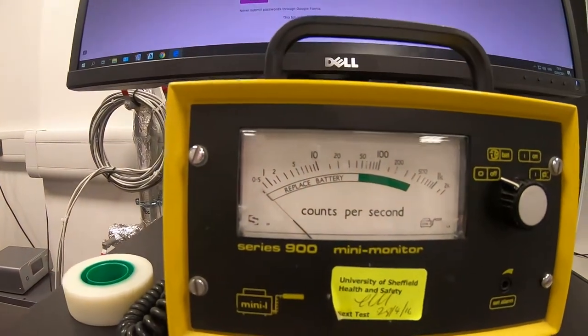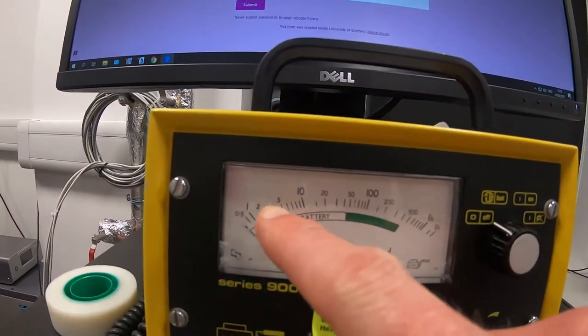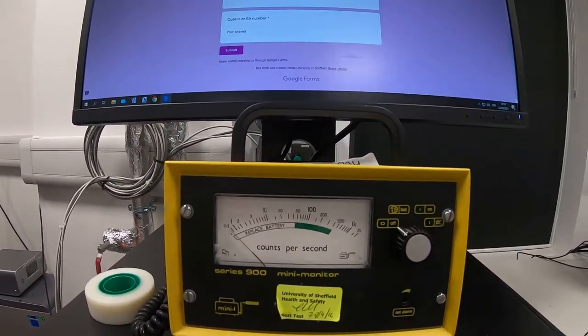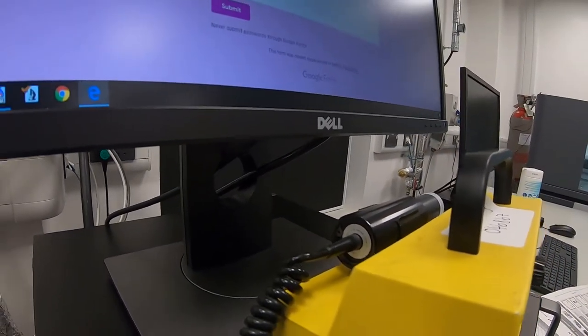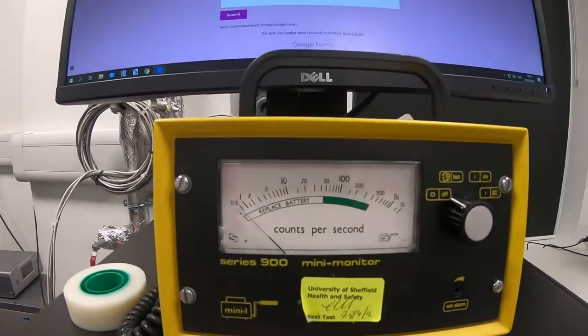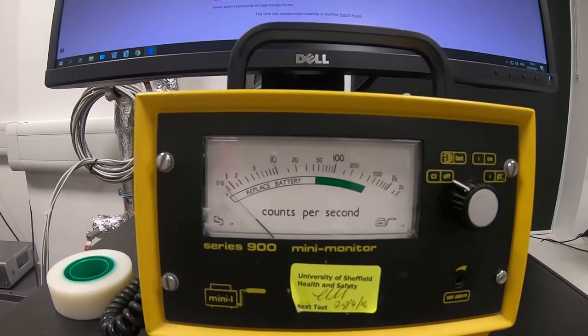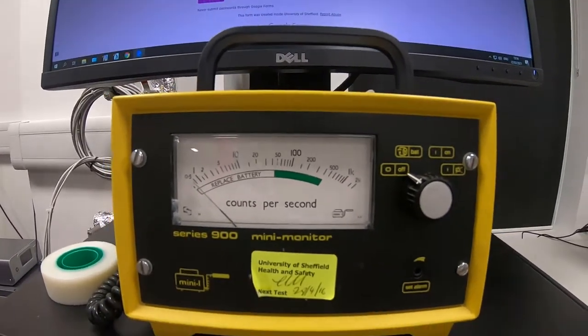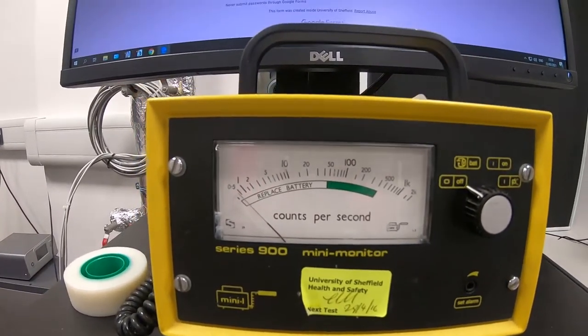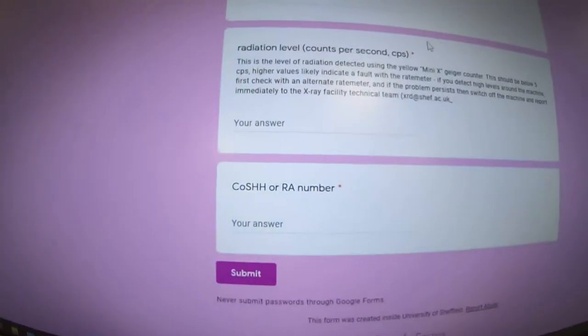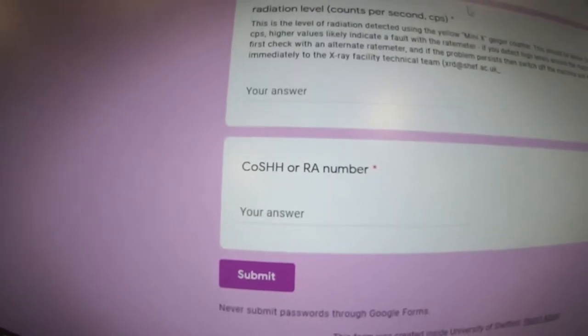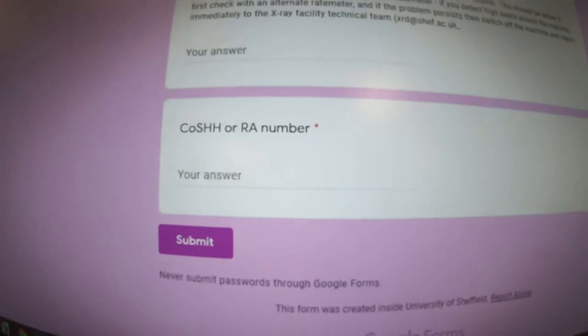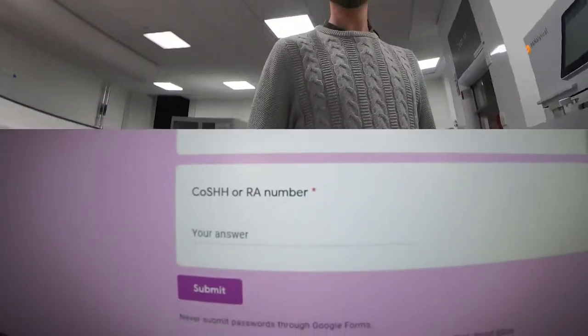This comes directly off the rate meter, so you'll notice that it'll hardly click at all generally, so you should be down at this end where it's between one and five counts per second. If it's much higher than that, it's probably because the instrument's a bit broken. Usually these cables get a bit damaged at the ends here, and that can cause it to count more often. The best thing to do is go and find another monitor and try that one. If you experience the same with high count per second, above 10, what you need to do is turn off the instrument with the big red buttons and come and get us straight away. The last thing to fill in on the form is your COSH number, or your risk assessment number. Everything that you create in the department is probably covered by either a COSH or a risk assessment. That needs to be brought into the lab with you every time you do your experiment and it should leave with you when you finish your experiment and you should note its number down here.